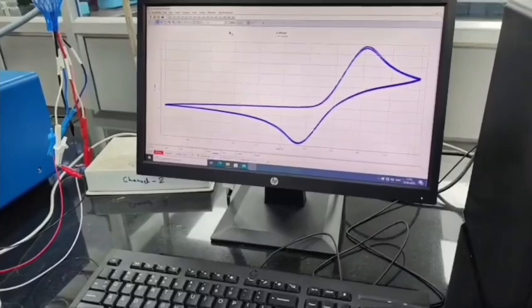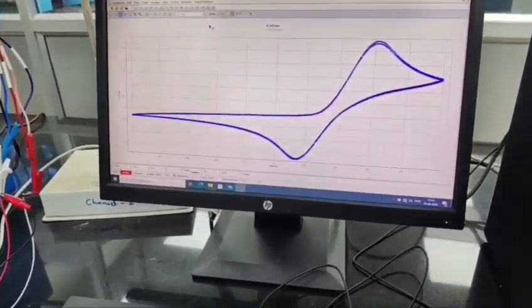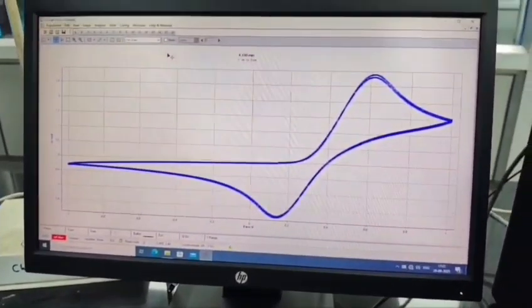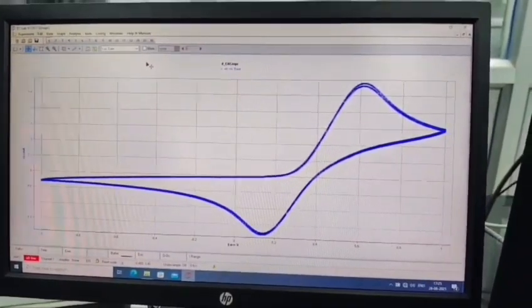This is the voltammogram. In this there are two axes. The x-axis shows the potential range from minus 1 to plus 1, and the y-axis shows the current from oxidation and reduction.